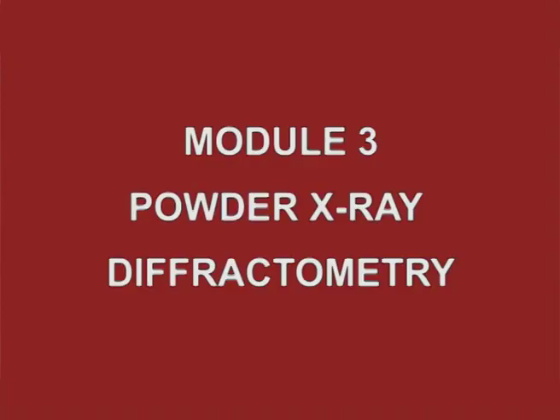Now coming to another module, module 3, powder X-ray diffractometry. In practice, it would be a time consuming operation to reorient the crystal, measure the angle theta and determine the d spacing for all atomic planes. A faster way is to use a method called the powder method.